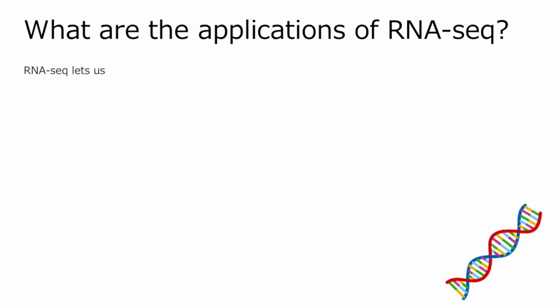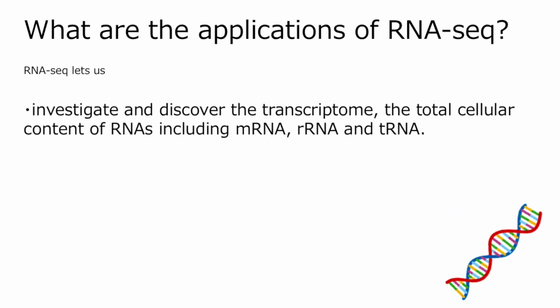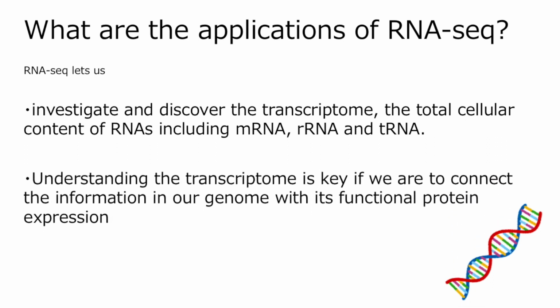First, what are the applications of RNA-Seq? RNA-Seq lets us investigate and discover the transcriptome, the total cellular content of RNAs including messenger RNA, ribosomal RNA, and transfer RNA. And understanding the transcriptome is key if we are to connect the information in our genome with its functional protein expression.